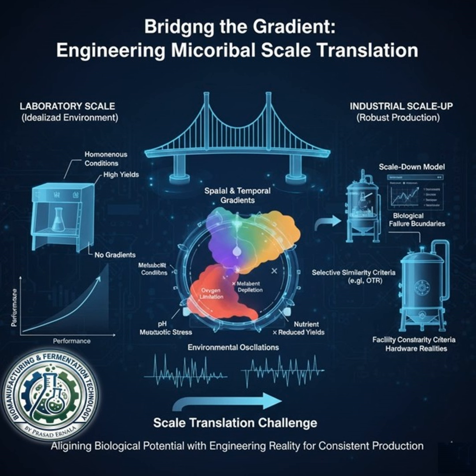And you might let other things slide, like, say, exact geometric similarity. You might have to, because that often conflicts with what the manufacturing plant can actually do. You deprioritize things that aren't the primary physiological bottleneck. Is there a concrete example of this kind of prioritization?